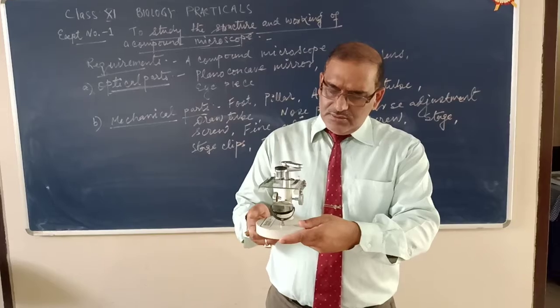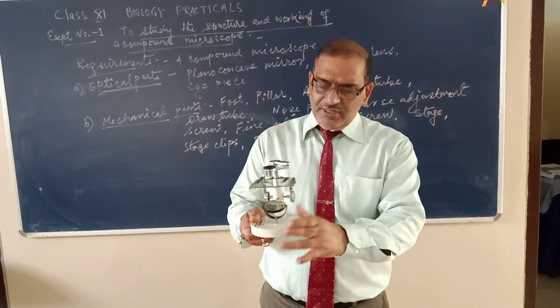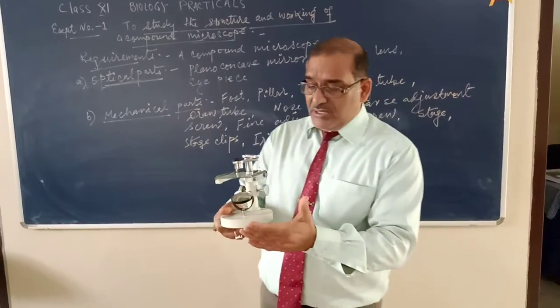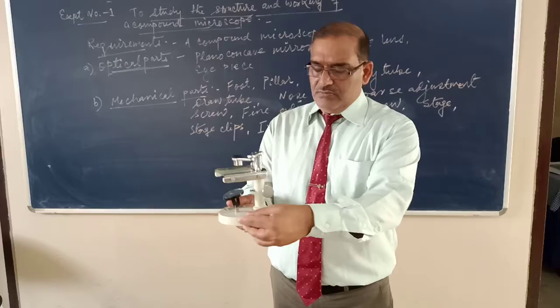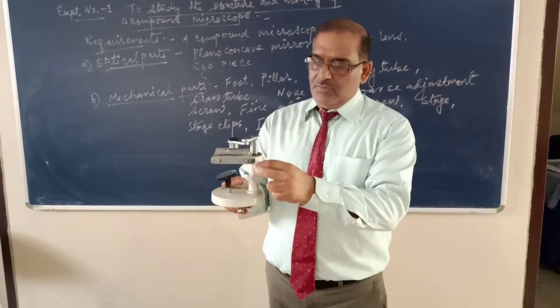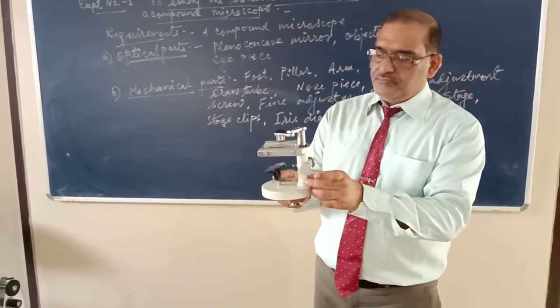This is the base. I can say this is the base of the foot, but it is not foot-like, it is a base. Now this is the base of the microscope, round. Now this is the body. This part is called the body. This is the body of the microscope.